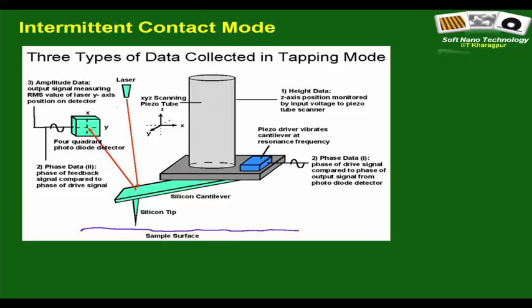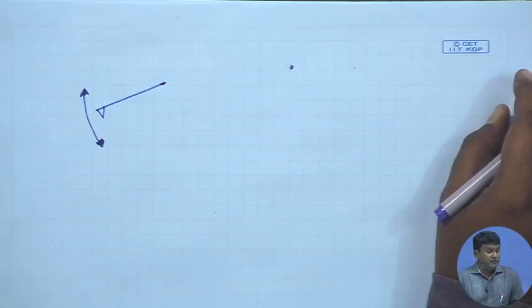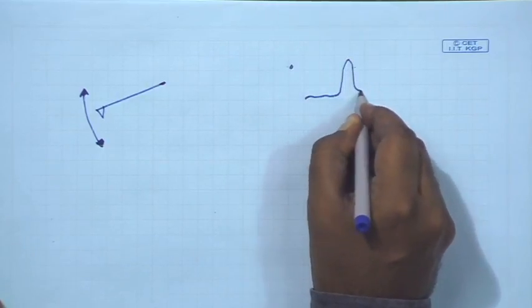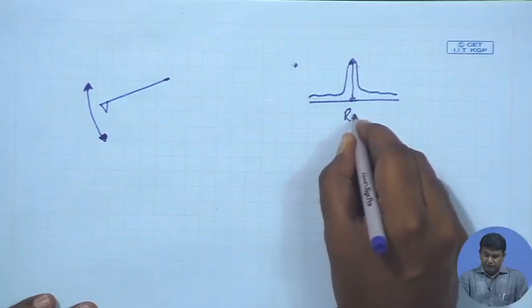The geometry is roughly the same, as the system is the same, except for the fact that there is an additional drive to produce the oscillation of the tip. Most commercial AFMs come with the option that you can do a frequency sweep and find out the resonant frequency of the tip you are using. Typically, the manufacturer specifies something, but every tip has different dimensions and geometry due to manufacturing tolerances. So, it is a good practice to find out the resonant frequency, and any reasonable instrument will allow you to do that.